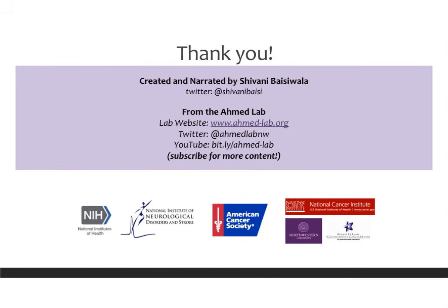So that's a quick overview of MTTs, both how they work and how they should be analyzed and presented.